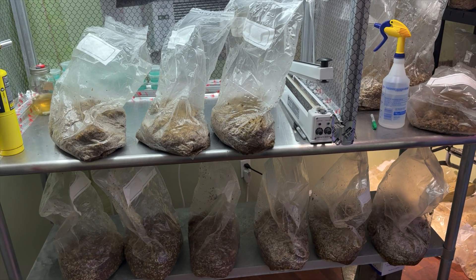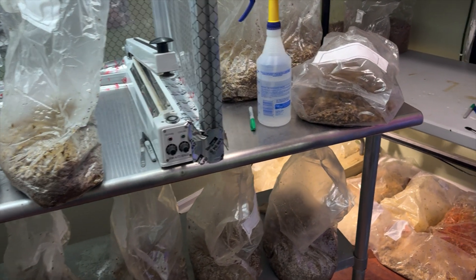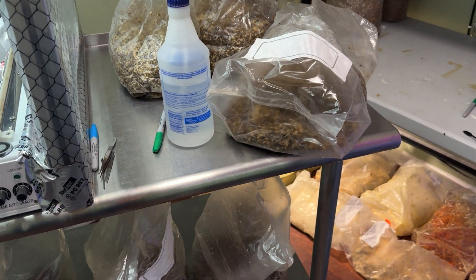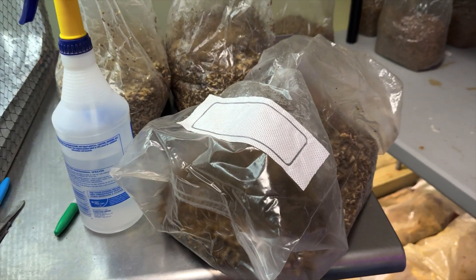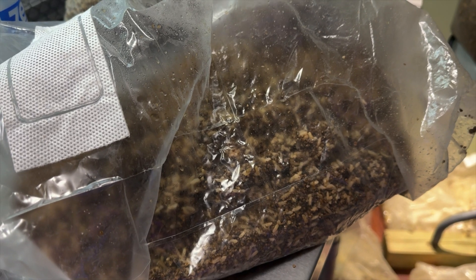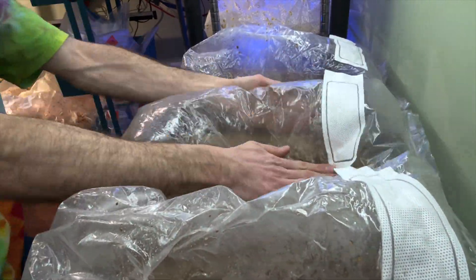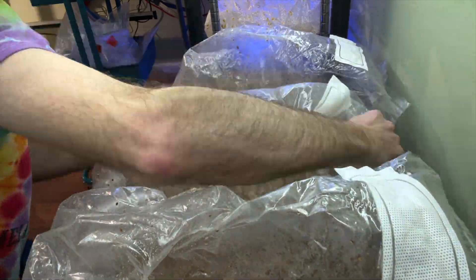This is our 12th set of inoculated cordyceps bags in the long patch. This is another grain trial of Japanese millet and brown rice together, so we'll see how that goes. Then we have to smash them and form them into cakes and cover them up for a week.